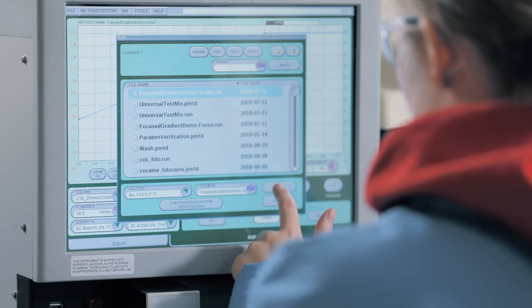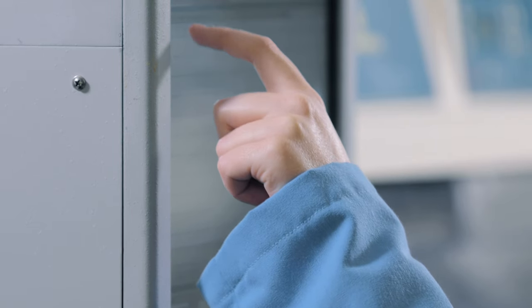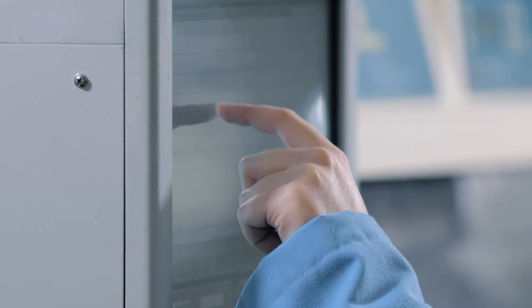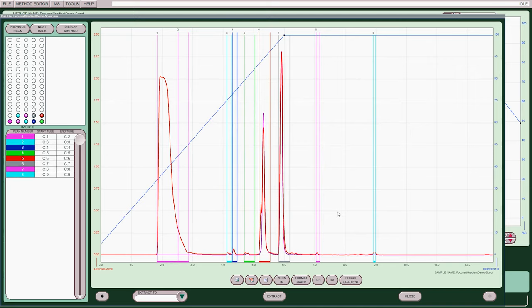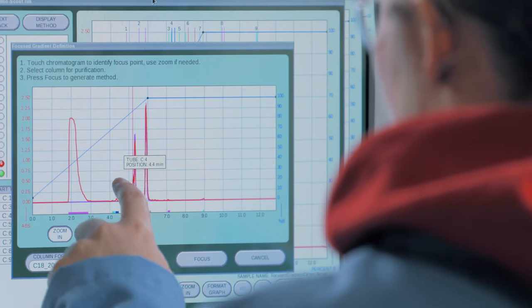When you use the scouting gradient, you can run a light load because you just want to see where the compound you want to purify elutes. Once the run is complete, Acuprep opens a window that shows the results of the scouting run. In that lower right-hand area of that window, press the button labeled Focus.